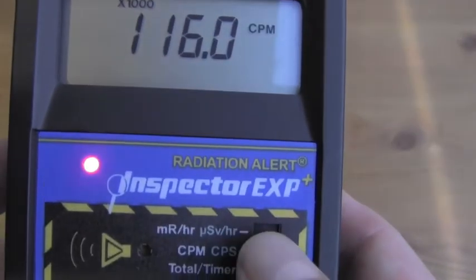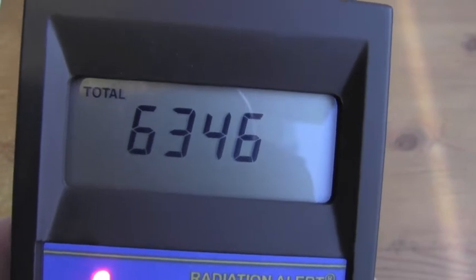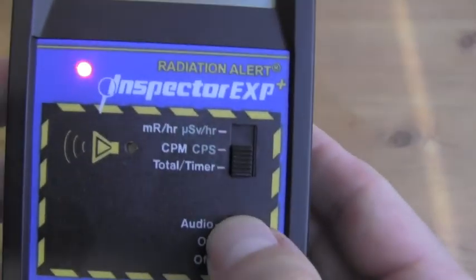Now we'll check out the scalar function. That'll just give us a total count over one minute. We will not wait for the entire minute here — I'm just going to turn this off.